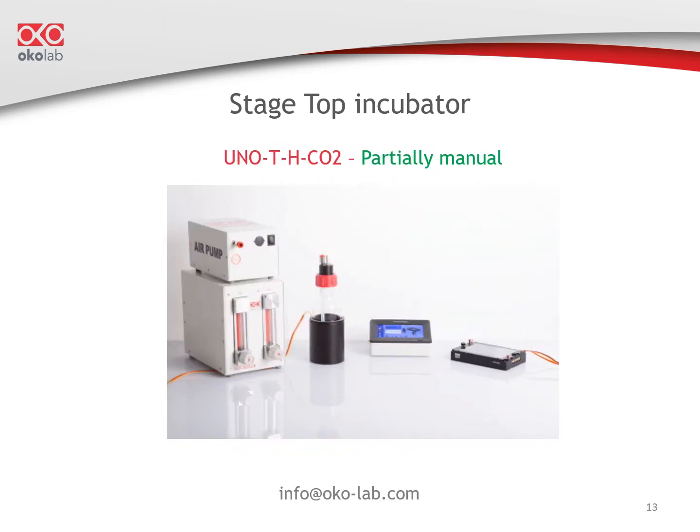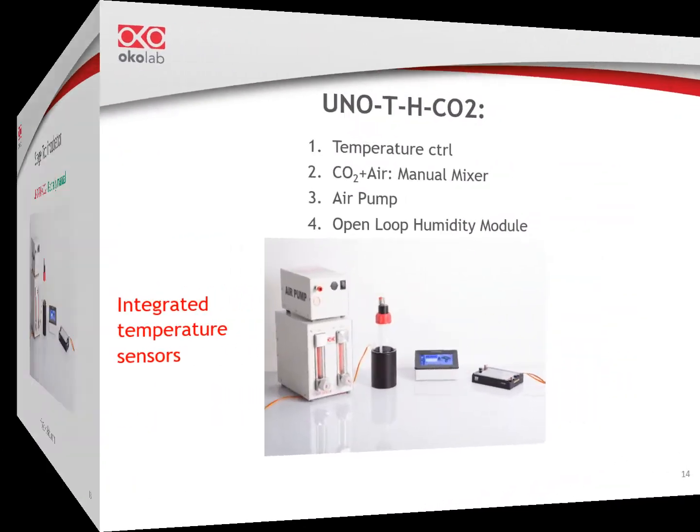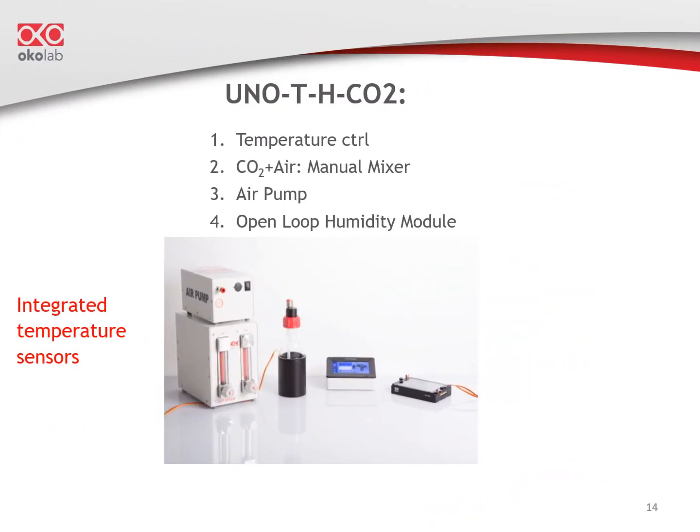Let's see it in more detail. UNO THCO2. T stands for temperature, H for humidity, and CO2 for gas mixing. We offer various combinations of this system depending on budget and needs, such as use with premixed gas, temperature and humidity only, or temperature only.